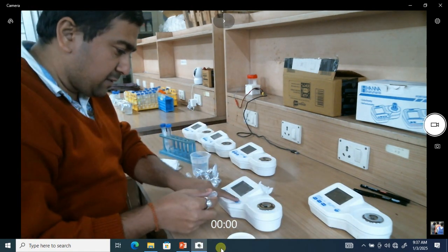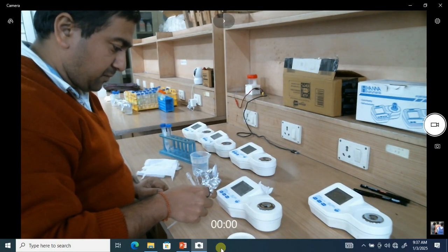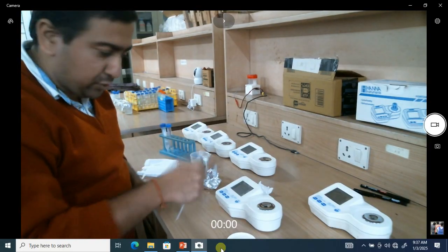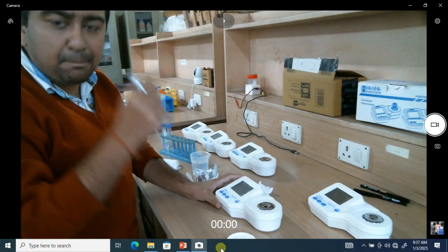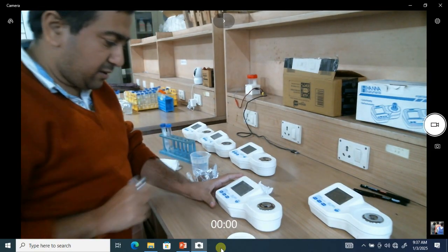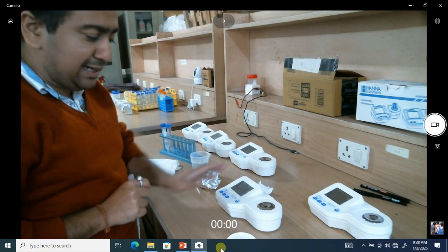Switch it on. So here is ND mode already. So what will we do? Range. Range is the key by which we can change the mode of the refractometer. See, ND20. ND and ND20.